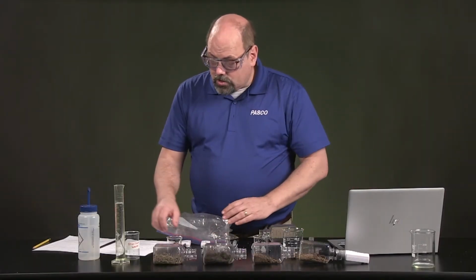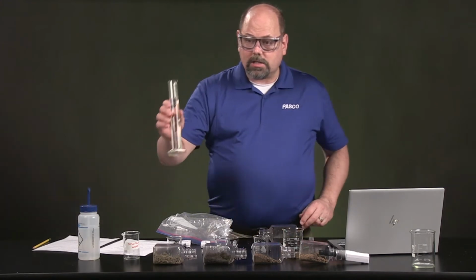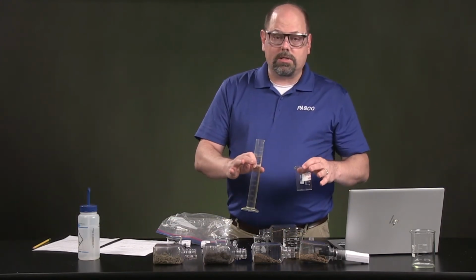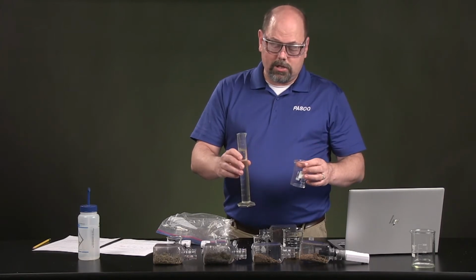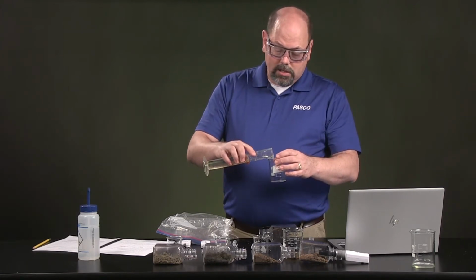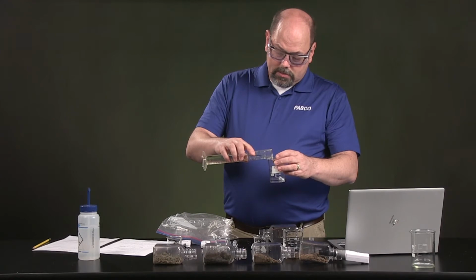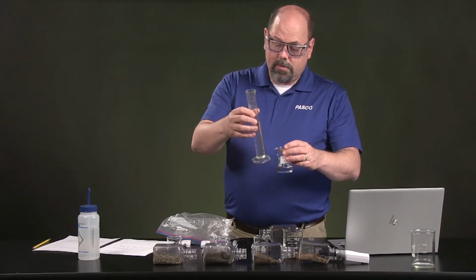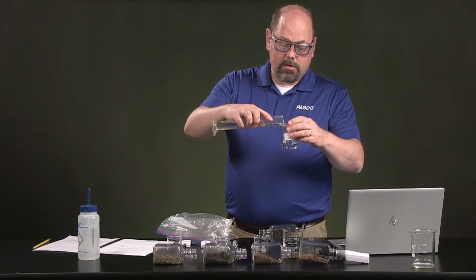When that's finished, what we're going to do to finish testing is use 40 mils of acid to see how much the soils have a capacity to resist pH change. So in that case, you're going to measure out 40 mils. I start off here at 100. I'm going to make sure I measure down to about 60, just a little bit more.